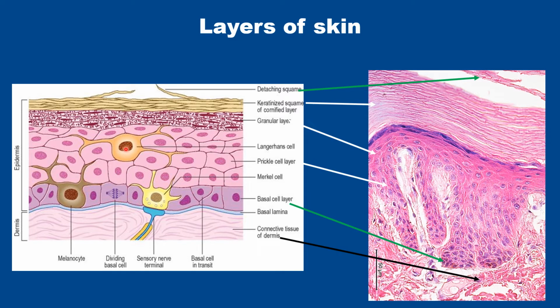There is another type of dendritic cell. You can see there are dendrites here. These dendritic cells are the Langerhans cells. See the position of the dendritic cell. Here it is in the middle of the stratum spinosum, but the melanocyte is present at the stratum basal.